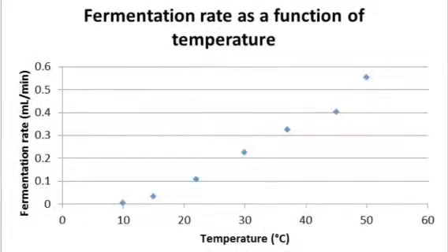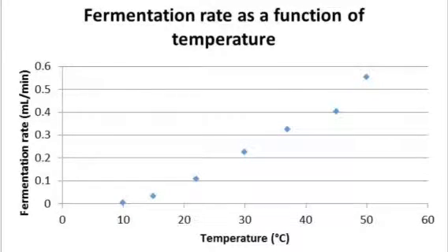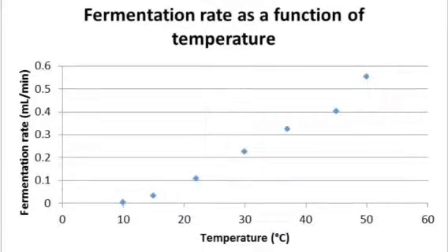A final graph was made which compiled the calculated rates of fermentation at various temperatures to demonstrate the relationship between an increase in temperature and the rate of respiration. In conclusion, when the temperature at which the yeast fermentation happens is increased, the rate of the reaction also increases. In other words, more ethanol can be produced in a shorter amount of time.